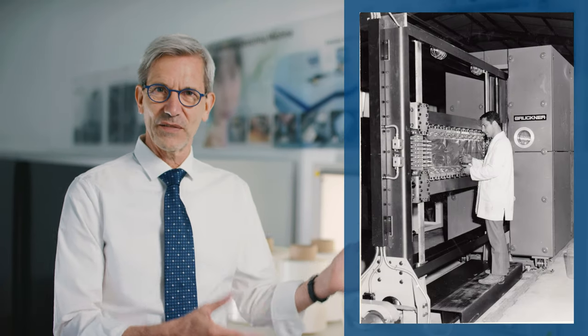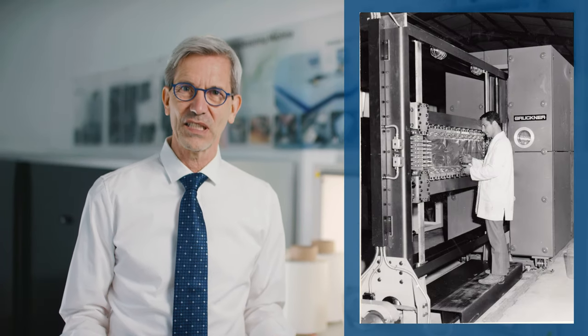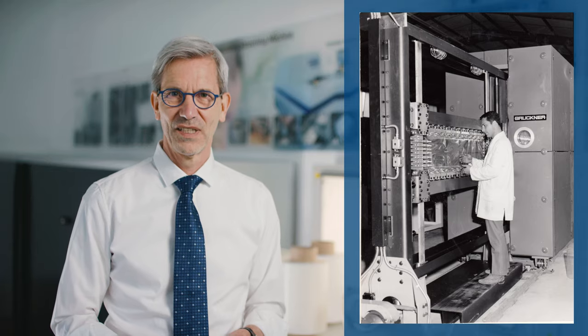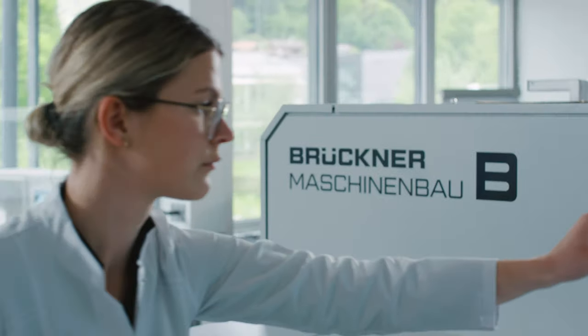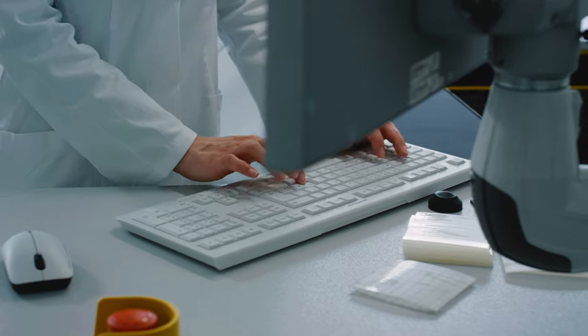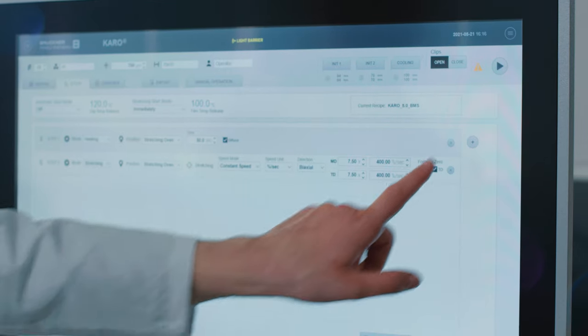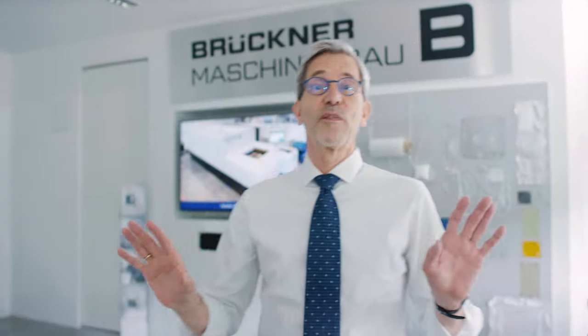Therefore, the industry is seeking small-scale equipment which perfectly simulates the actual production process, but keeps costs low and makes changing the parameters fast and easy. This is why Brückner has designed KARO, and this machine is already the fifth generation of our lab stretcher. The history of these machines built by Brückner dates back to the 1960s. Here you can see our first-ever tenter with a pantograph built nearly 60 years ago. Since the machines have become smaller and smaller, nowadays they fit into nearly every laboratory, which makes KARO one of the lab stretchers most used worldwide.